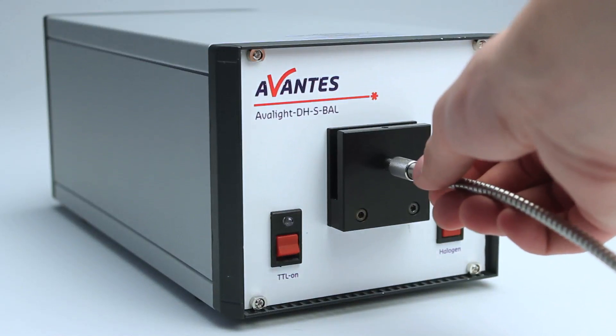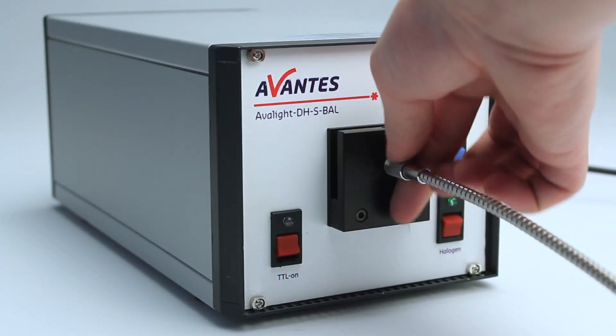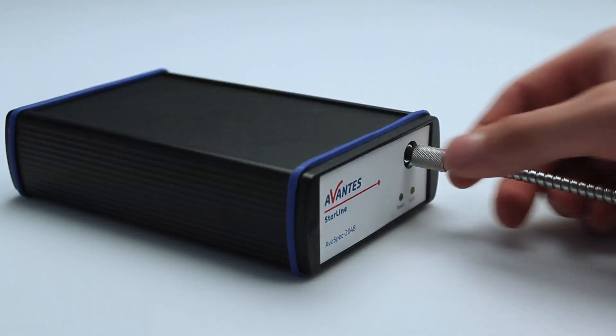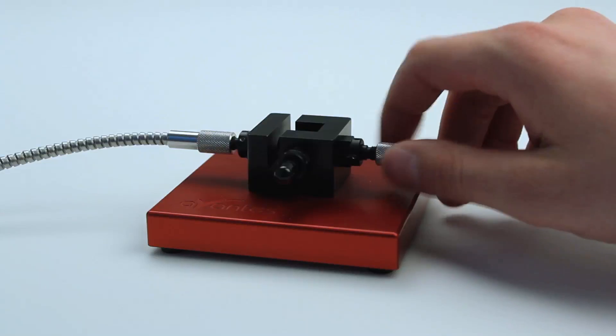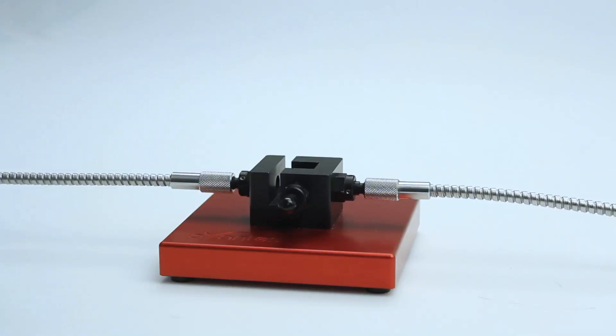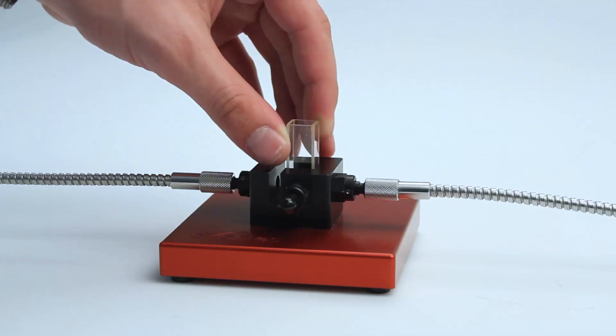Start by connecting the light source to the cuvette holder. Afterwards, connect the spectrometer to the cuvette holder. Put the cuvette in the cuvette holder and place the black cap.